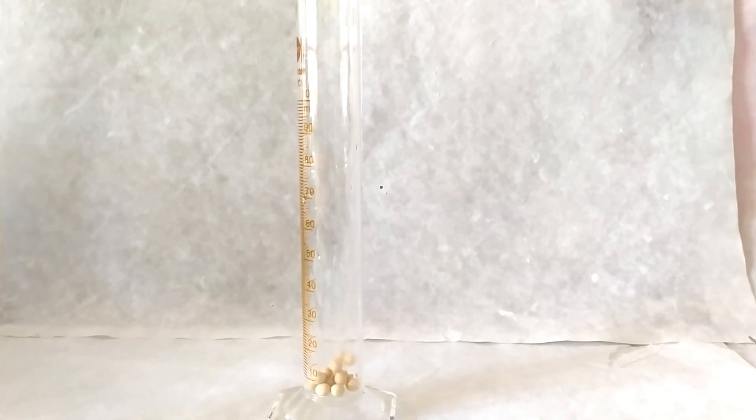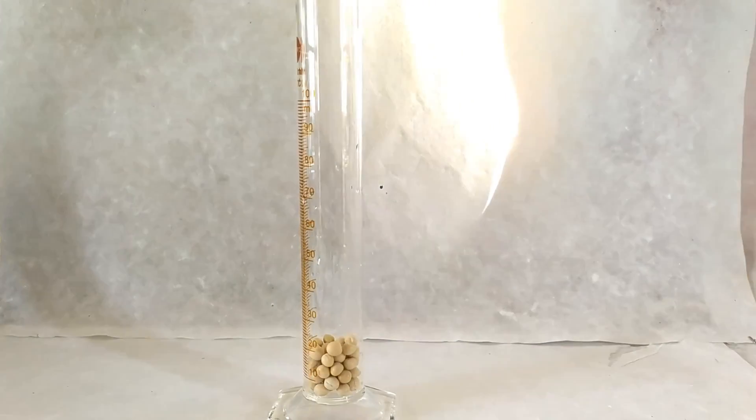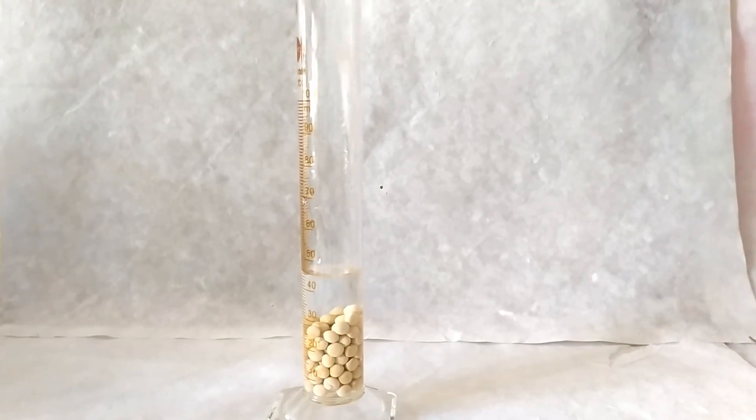Begin the experiment by adding a certain volume of dry seeds into the graduated cylinder. Add a certain volume of water to the seeds. Leave the seeds in the cylinder overnight.